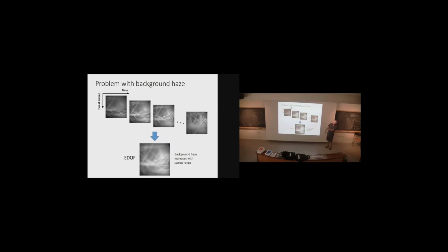So here's an example. What am I doing? Here's some kind of tissue structure. What am I doing with extended depth of field? Basically, I'm taking 2D images at this depth, at this depth, at this depth, at this depth. At all depths, some of the structures are in focus, but a lot of the structures are out of focus. And then I just integrate them. I add them all up, right? And my final extended depth of field image looks like this.